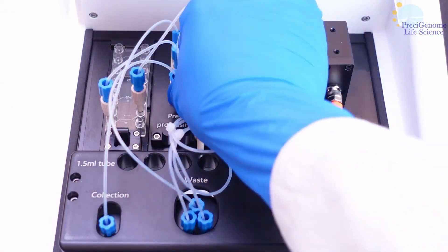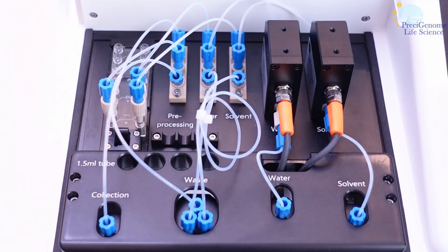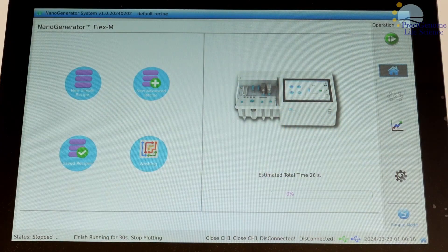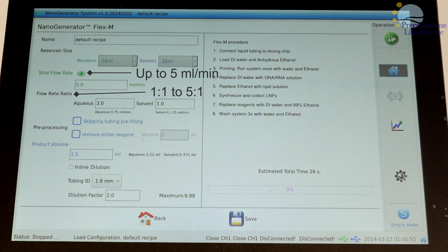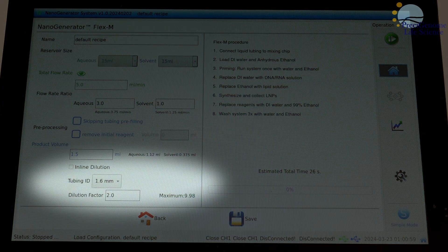Once assembly is complete, we may move on to the software operation for the device. The FlexM software has several parameters which can be tuned to suit applications. The total flow rate may be set up to 5 mL per minute, while flow rate ratio may be set from 1:1 to 5:1. The total volume may be set from 1 to 12 mL, though safe values vary by formulation.